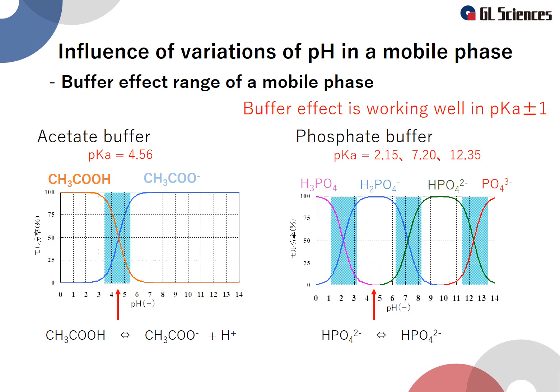With respect to the buffer, a buffer works well when the pH value of the mobile phase is close to the pKa value of the chosen buffer. The pH of the mobile phase should fall between the pKa value minus 1 and the pKa value plus 1. Please note the difference between the pKa of the analyte and the buffer.